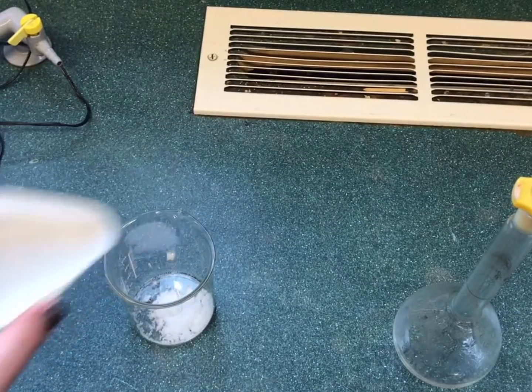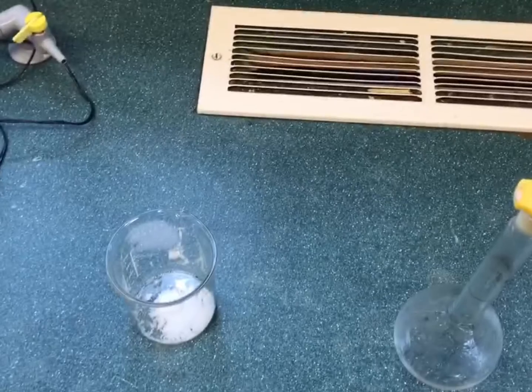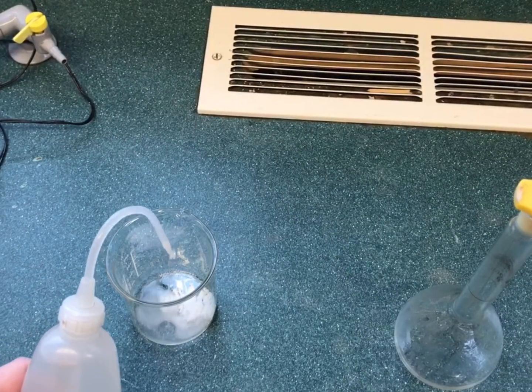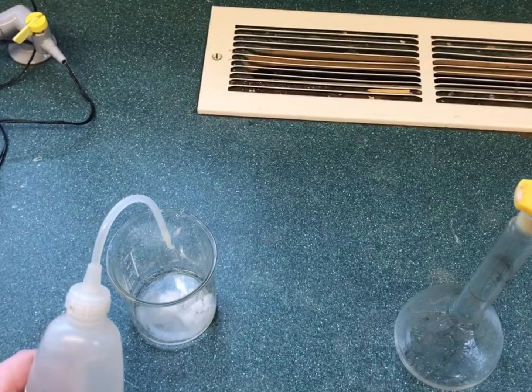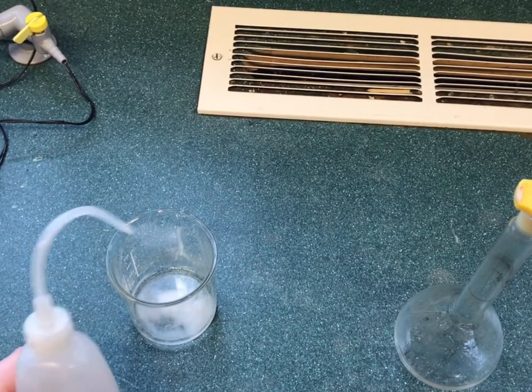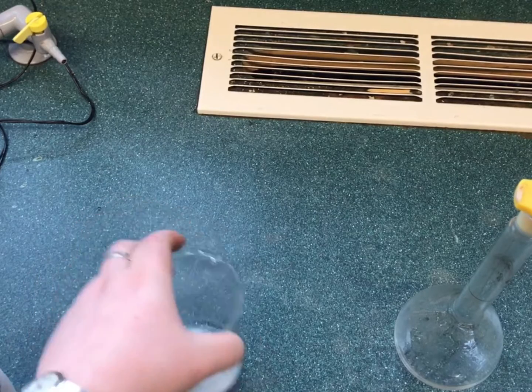Once in a beaker, a small volume of deionized water is added. Deionized water and not tap water is used, as tap water contains impurities that may affect future readings during reactions with the solution. The solution is stirred until all solute has dissolved.